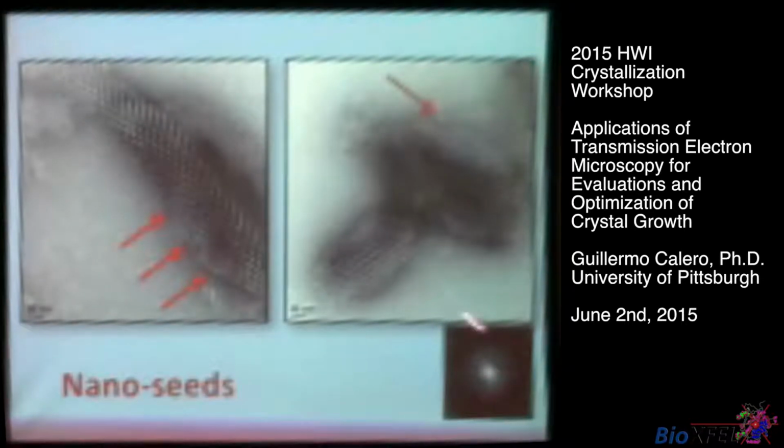And I'm not sure how well you can see this because of the quality of the projector, but if you're interested, I can show you. These were actually 4 other bright spots. So that meant the lattice was quite ordered for this level of negative staining.